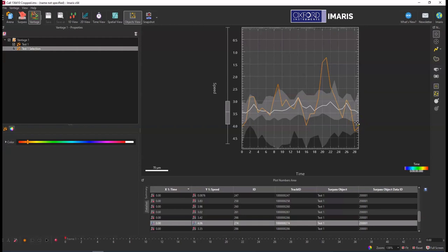It might not be exactly the same, but this is about as close as you can get unless you wanted to snip the actual graph from the statistics tab in the Surpass scene.